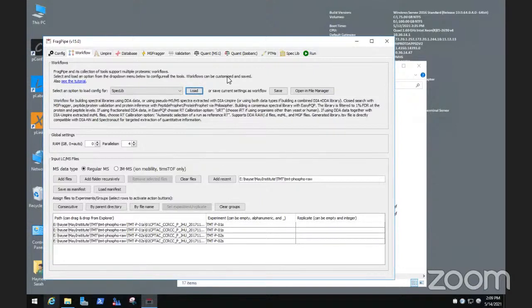And I think we should have an option to allow loading the library.tsv file into Skyline, because it may be a beneficial option, since our libraries are filtered based on protein FDR and peptide FDR. They're protein inference analyzed. I think they're really good libraries.